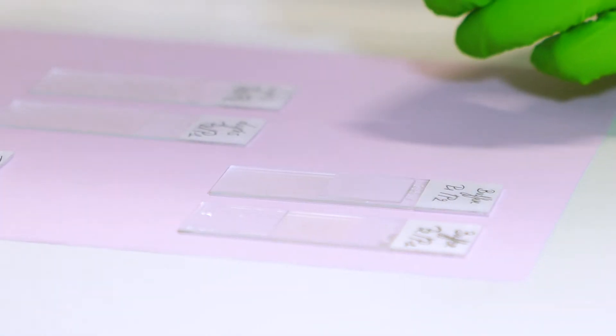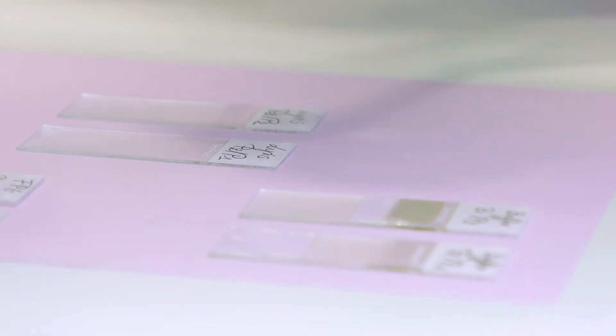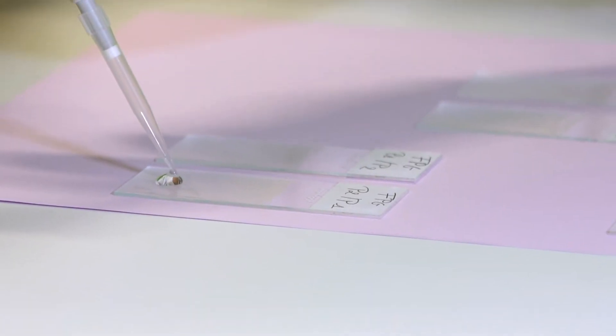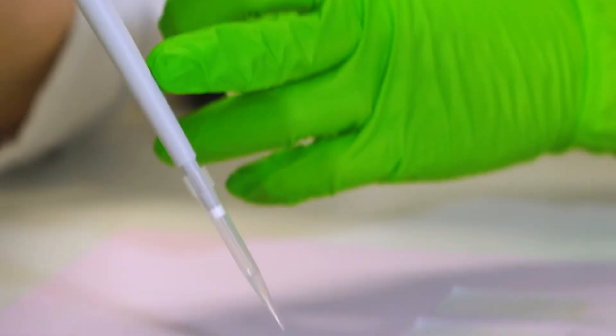Depending on which assay you're going to perform, either the BER or the NER assay, you have to embed the corresponding cells, so either the Rho or the UV exposed cells, in low melting point agarose.